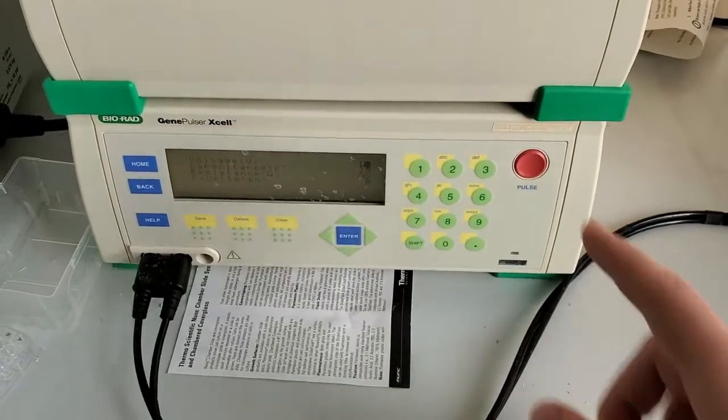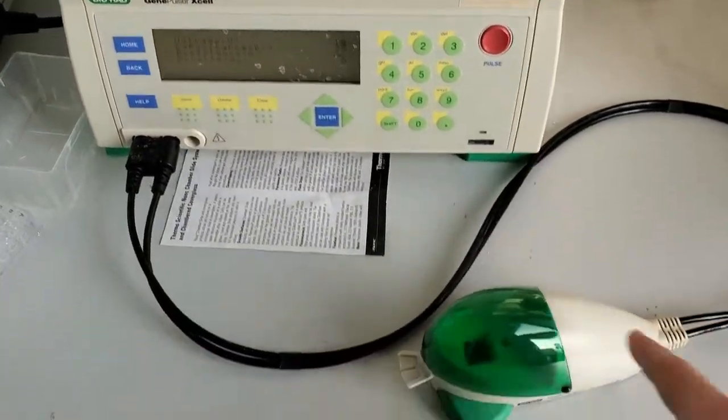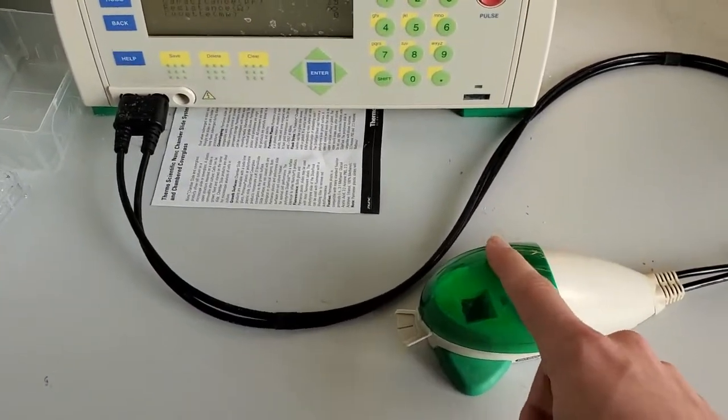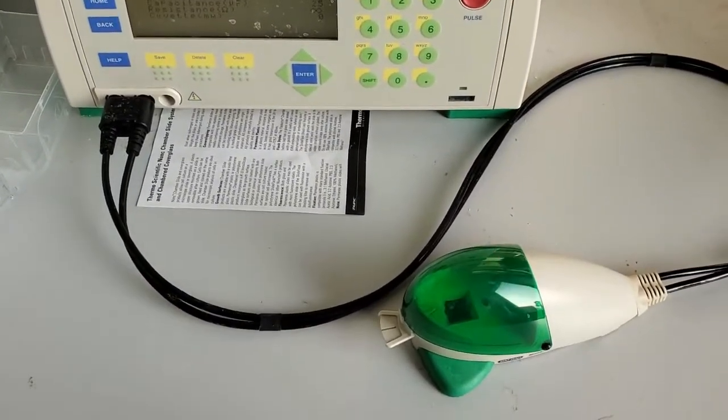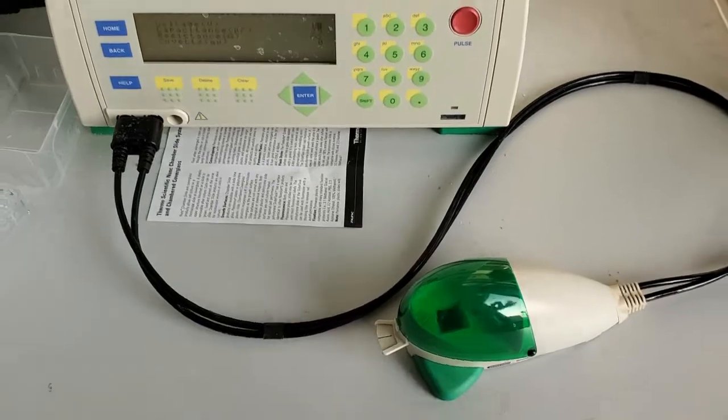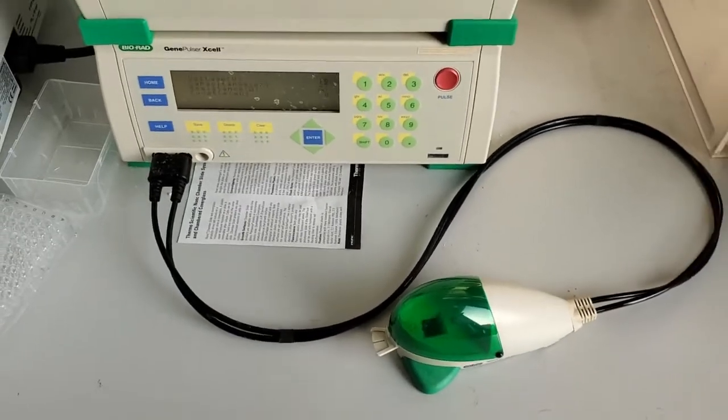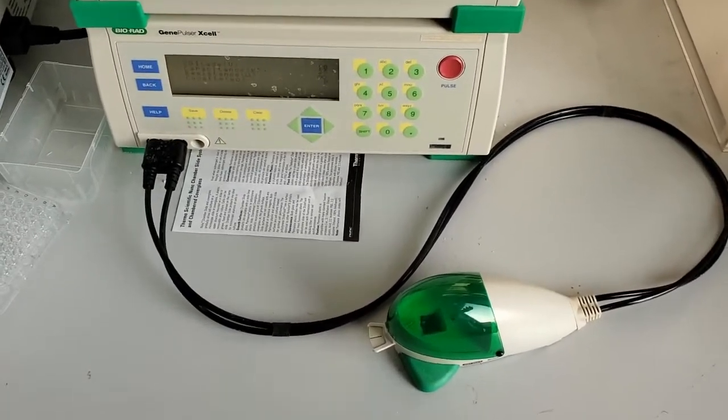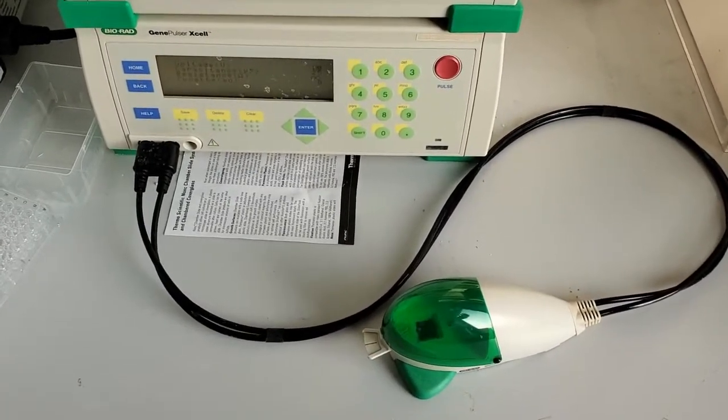Hit pulse. Fires through this across the cuvette. And then hopefully your cells are electroporated. So fairly simple.